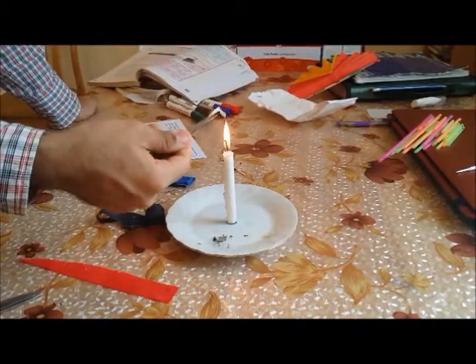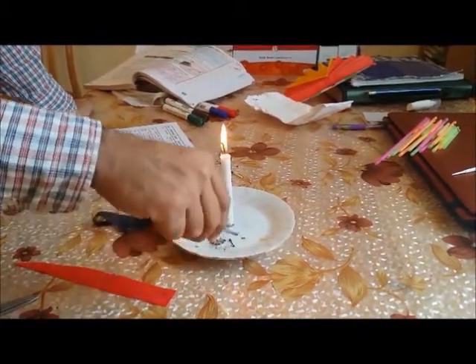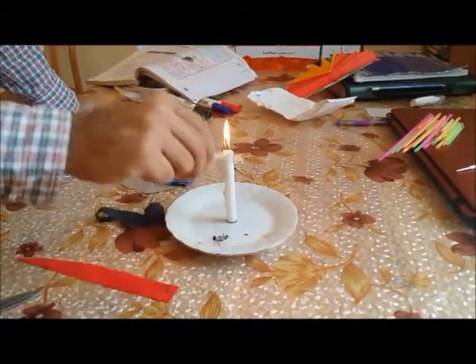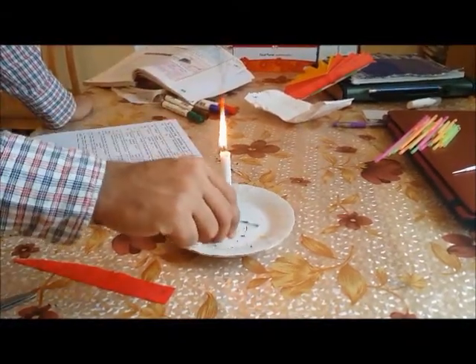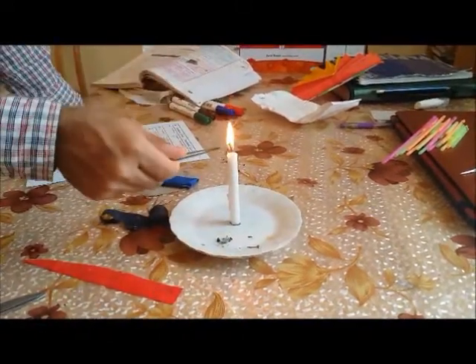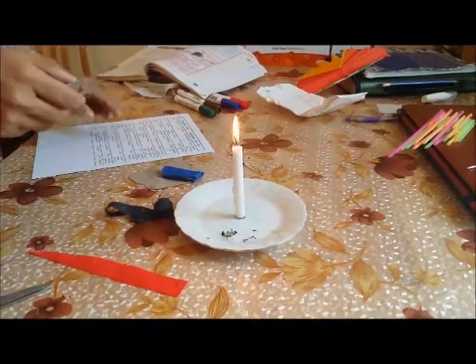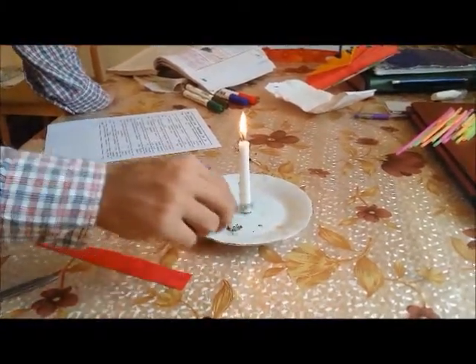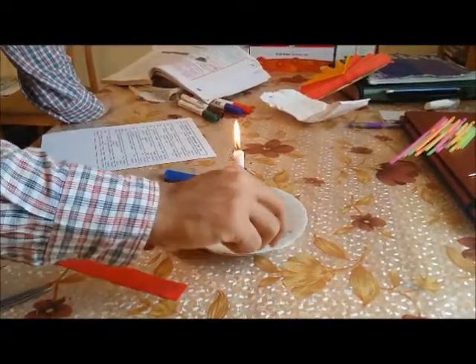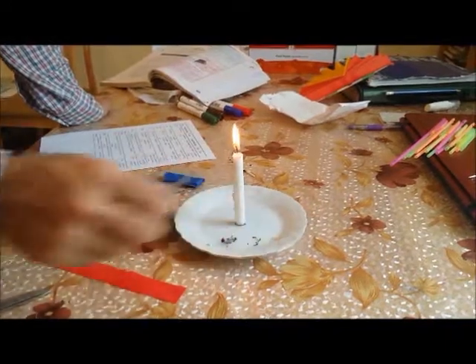It burns very slowly — very slowly. And very sticky at the same time. You can see the black flame coming because it got stuck to that area. And it burns with very great difficulty — not so easily it burns.